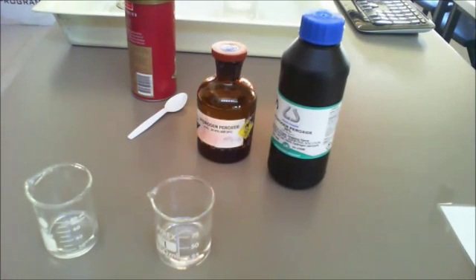Welcome, ladies and gentlemen, to today's practical, which is on catalysts. Catalysts are chemicals that speed up the rate of a chemical reaction without being consumed. So as long as you have enough of the reactants available, then you can simply have your reaction continuing at a faster rate indefinitely. Obviously, the concentration of the reactants will limit that.